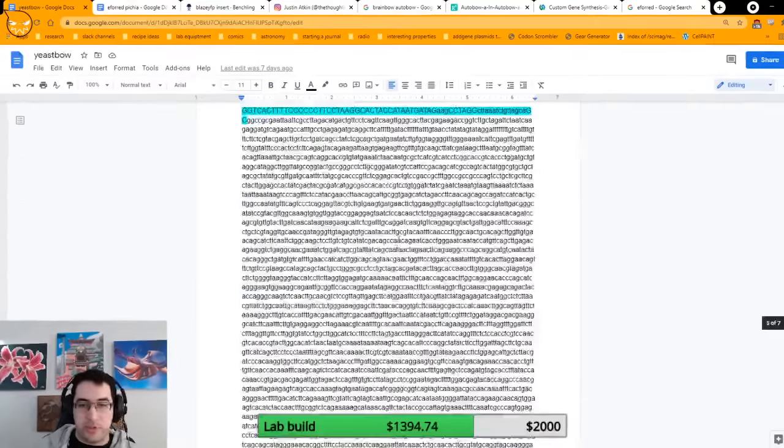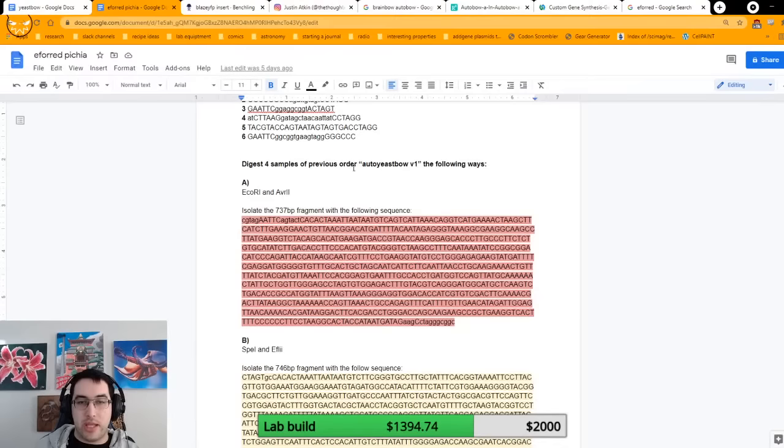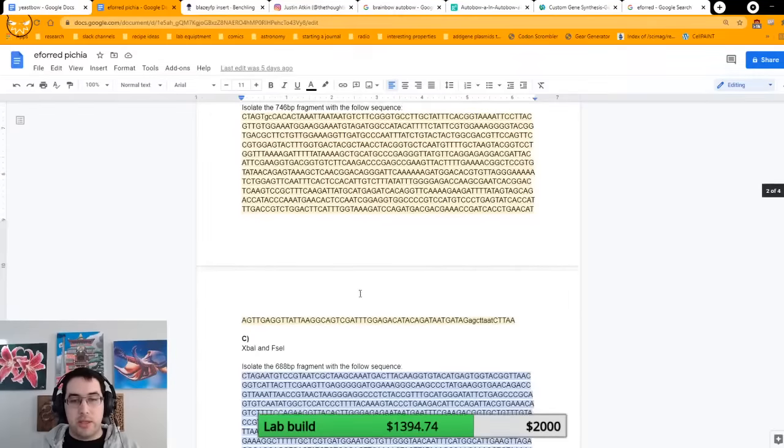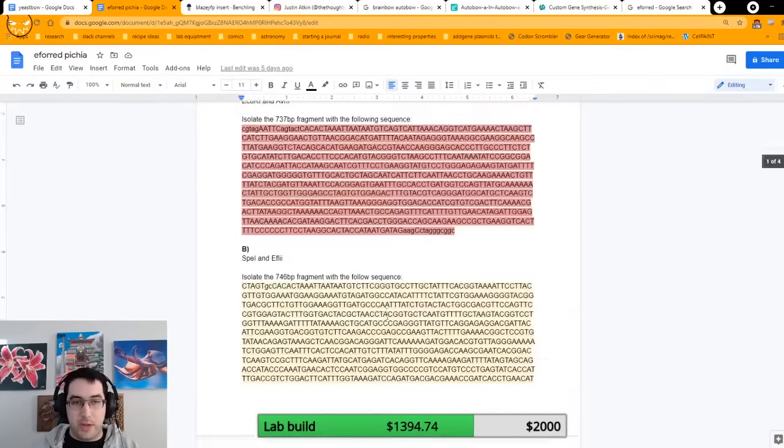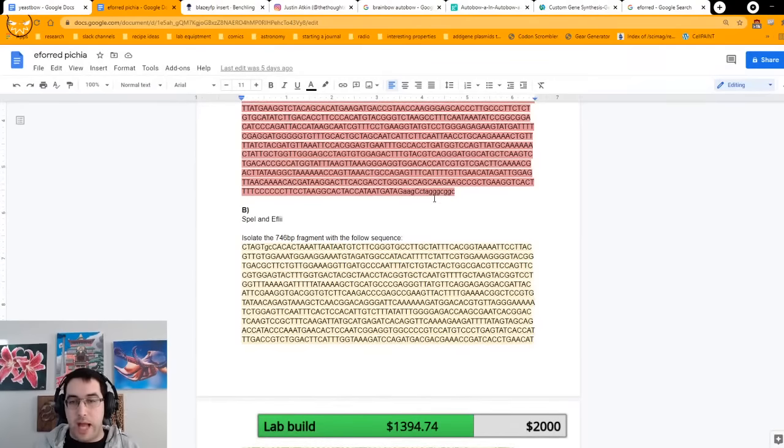Then what I'm telling them to do is take this order that we just went through, which I told them to call Auto Yeast Bow V1. So I said take 4 samples of Auto Yeast Bow V1, so now they're going to have 4 tubes, each with a little bit of this DNA in it. Then I tell them to digest each sample with 2 different restriction enzymes, which cuts out the 4 different proteins individually, and I color coded them to keep track.